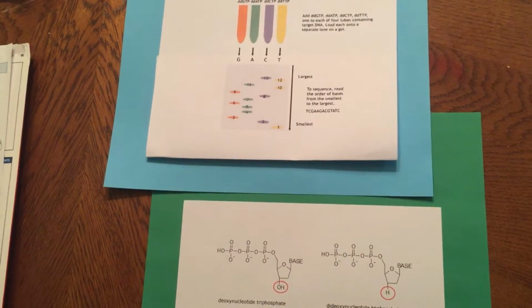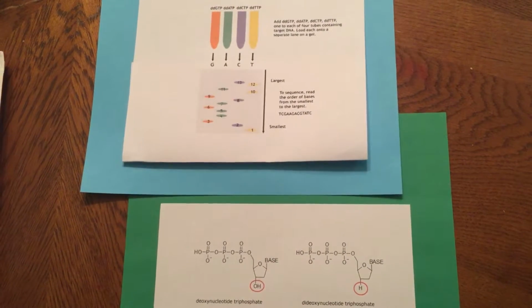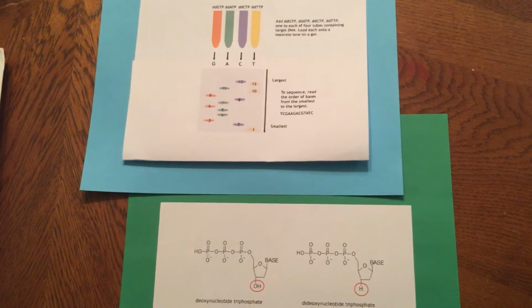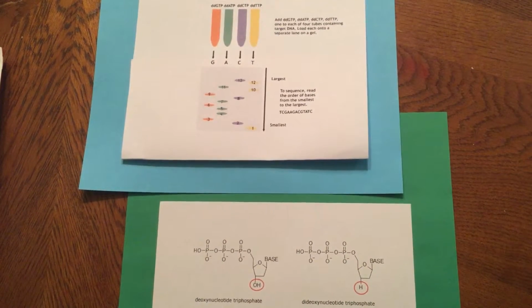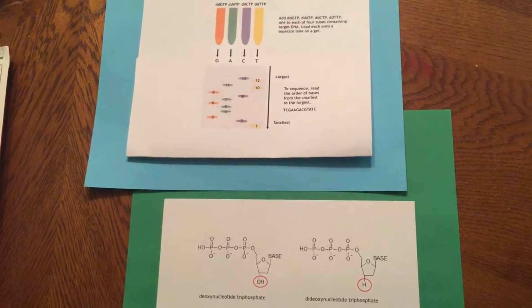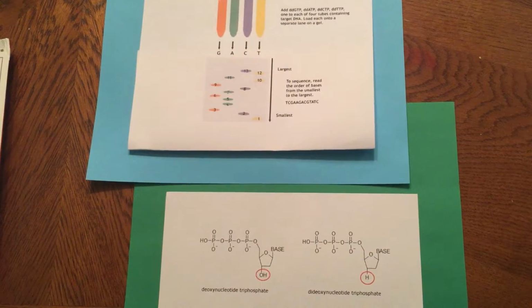DNA cycle sequencing is also known as the Sanger method. It's a method used to determine the order of the nucleotide bases in a strand of DNA, so it determines adenine, guanine, cytosine, or thymine. And it starts out very similar to PCR in that the first step is denaturation.